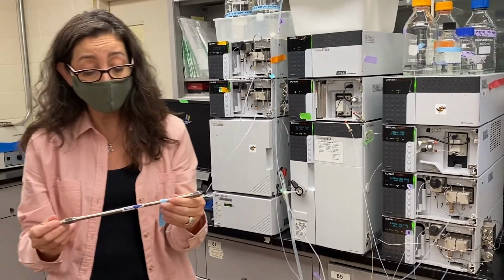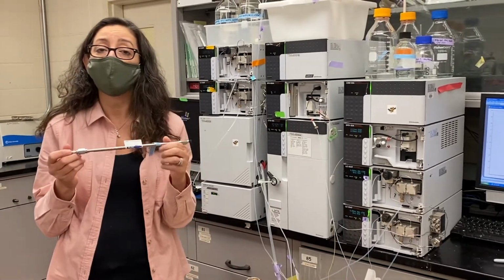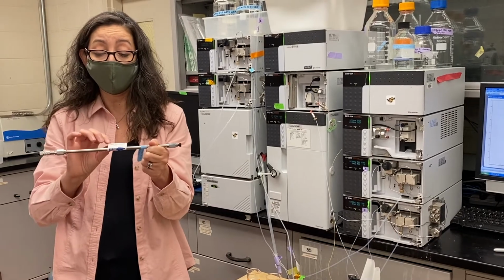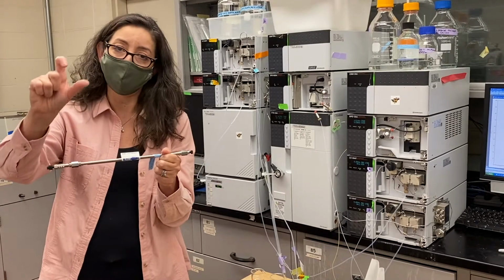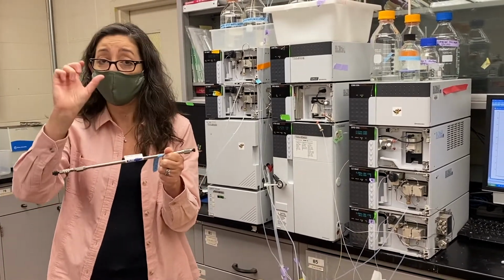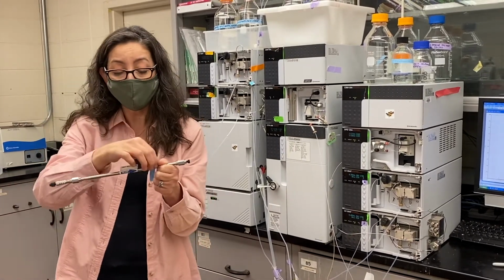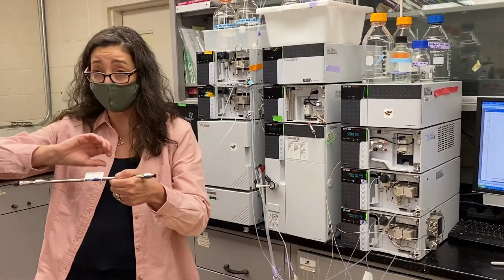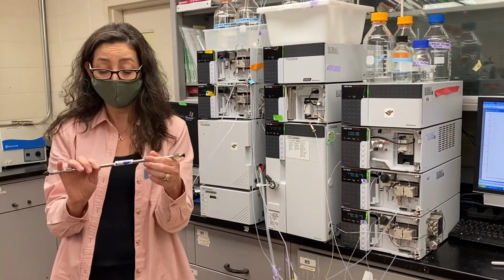Now this column here is a C18 column. What that means, I'll explain in lecture if we haven't gotten to that part yet, is that you have silica bonded to 18 carbons in a chain. That's why we call it C18. So that makes the stationary phase hydrophobic. When the silica is derivatized with C18, the column or the stationary phase becomes hydrophobic.